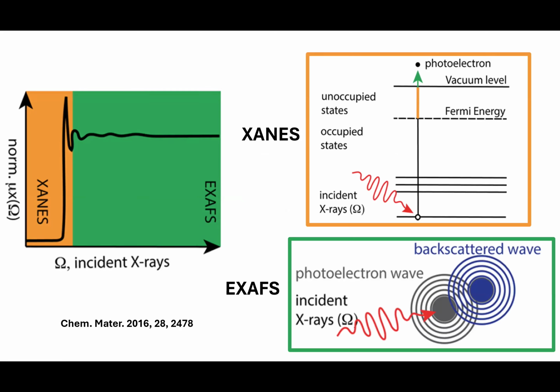This is a very typical spectrum, and usually we feel this is more like a hard X-ray spectrum, right? Because it has a beautiful EXAFS region, but it's not exclusive to hard X-ray. We can also collect EXAFS. As I mentioned, if the beamline and the sample are perfect, we can also access the EXAFS for the tender X-ray. So we have measured the sulfur EXAFS and phosphorus EXAFS at APS. They work in the same way as hard X-ray, and you can also interpret the data, right?